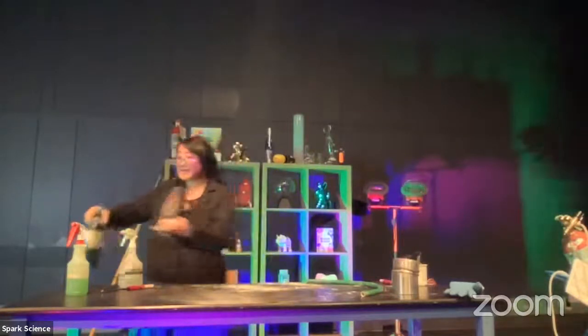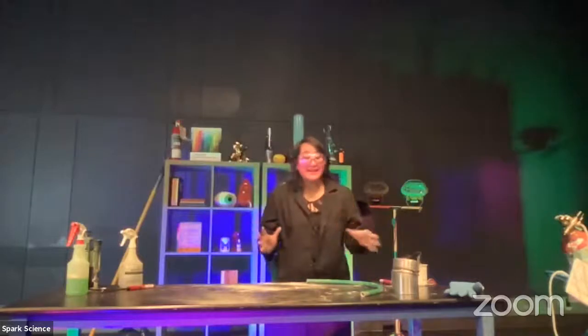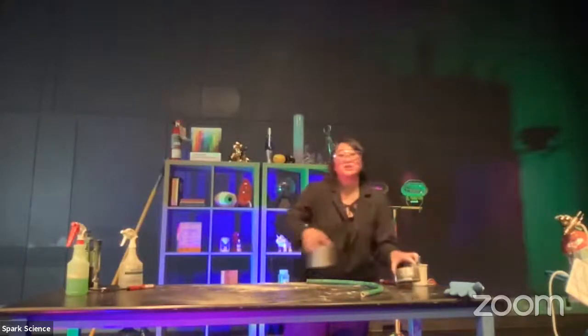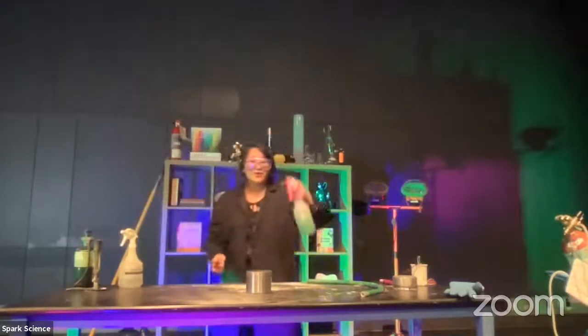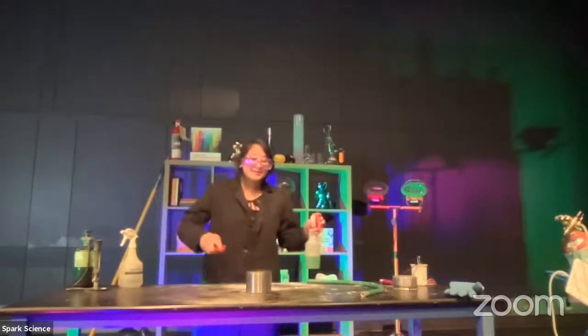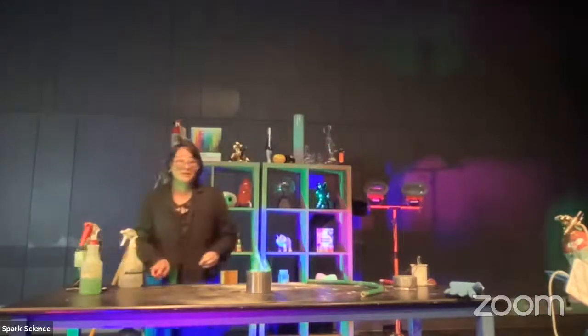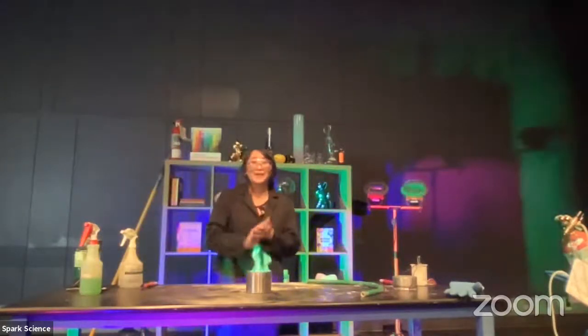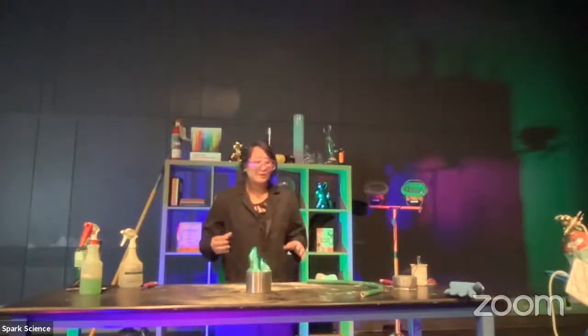And we saw a lot of neato experiments here today, but it happens really fast. Combustion chemical reactions are really rapid. So I'm going to show you again our copper chloride just once more. You're going to see this beautiful flame here. I've soaked cotton balls with the copper chloride. And what you're seeing is the copper burning, beautiful blues and greens.